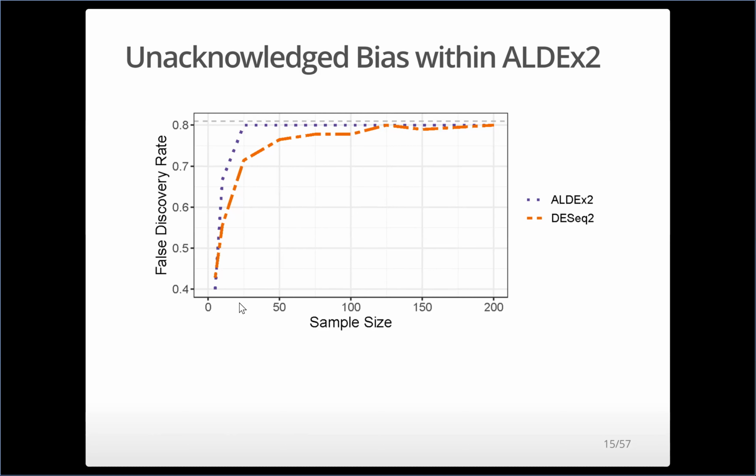Again, it's this argument of rather than relying on some intrinsic definition imposed by a normalization, whether it's ALDEx2, DESeq2, edgeR, whatever it is, we're arguing to step away from that, let's be explicit and include scale models, because to do this type of inference, you have to make a statement about scale. So let's put it in the forefront and not use whatever's just implied.